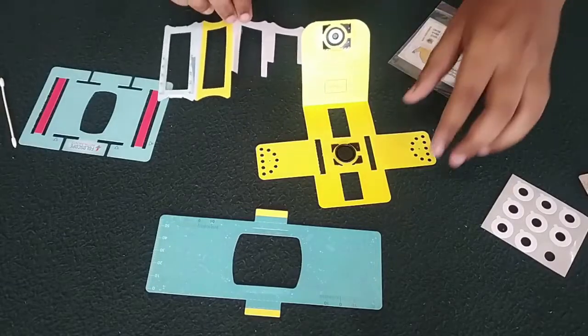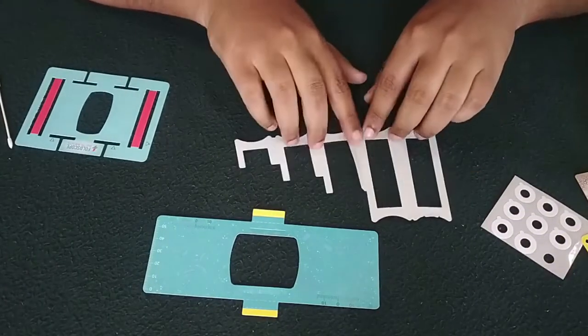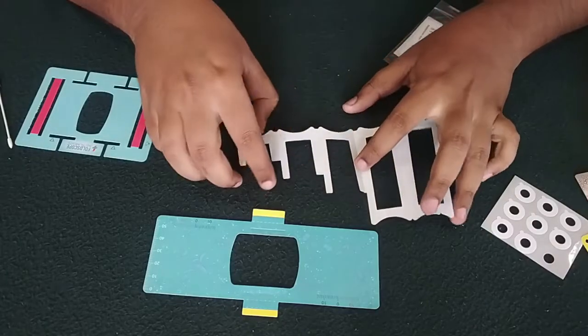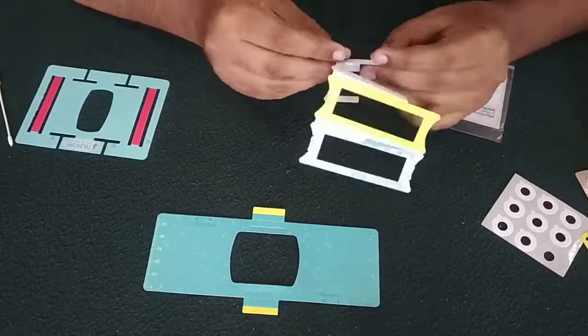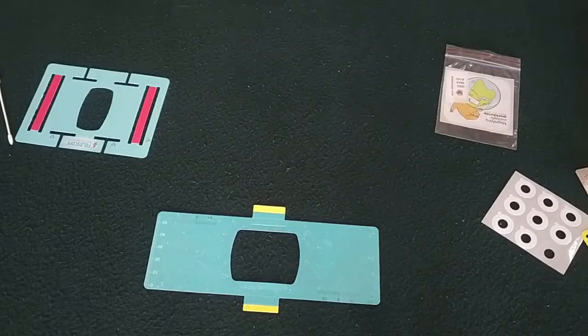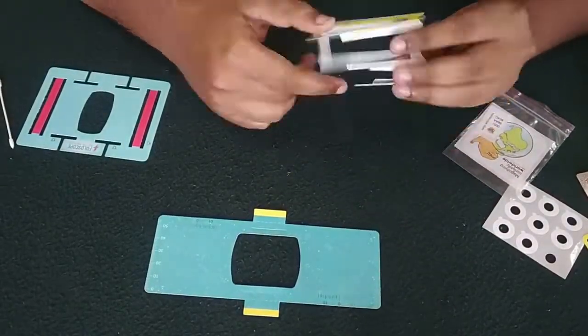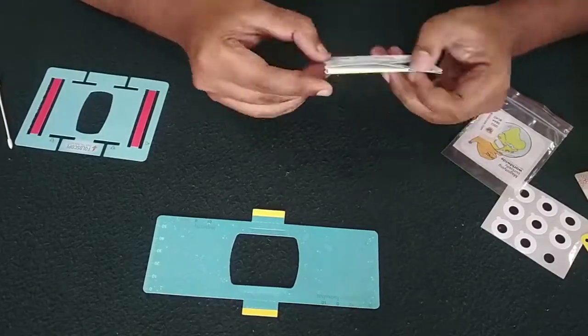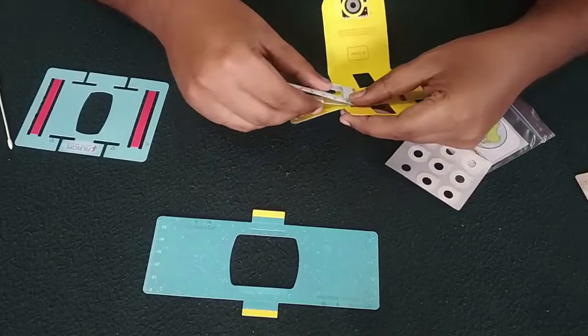Now taking this part, we just keep aside, keeping the grey side up, or we can say white side up. We need to fold the dotted lines. Now we need to insert this in this ramp.